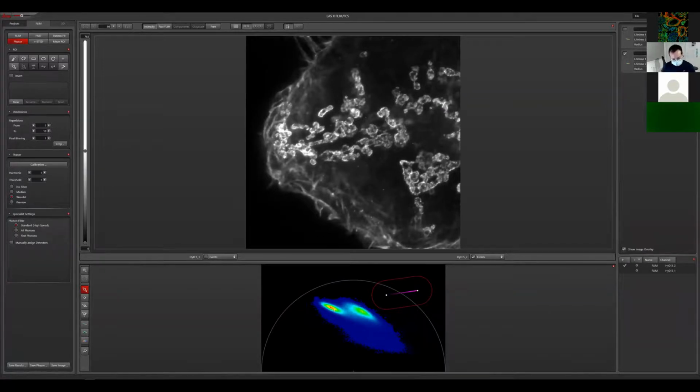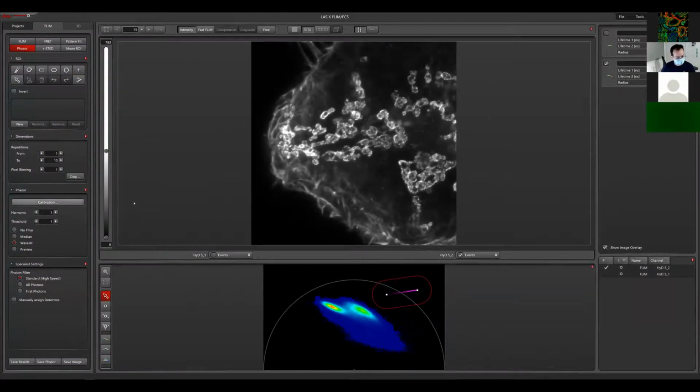So we'll have our two areas here, and then we'll have another area that we don't see, but normally should be down here, that corresponds to the depletion laser and also to the very short lifetimes. And these are the ones that we want to avoid collecting.